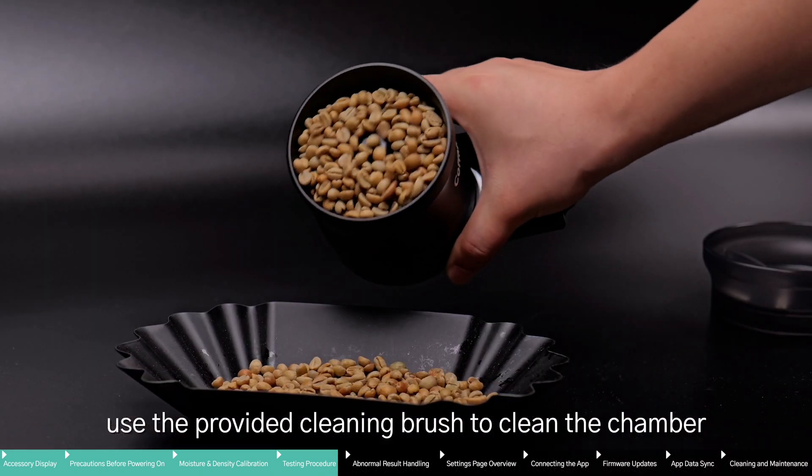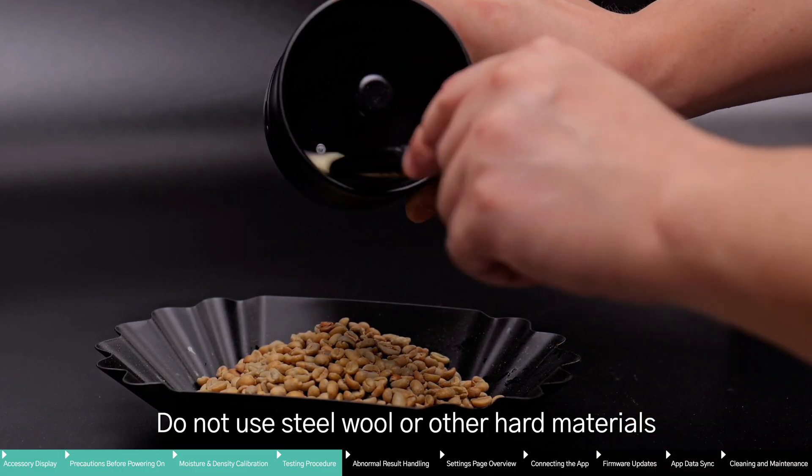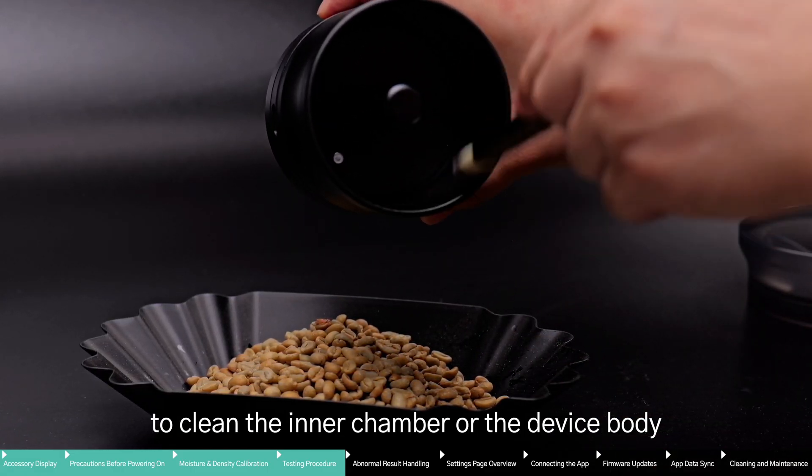After testing, use the provided cleaning brush to clean the chamber. Do not use steel wool or other hard materials to clean the inner chamber or the device body.